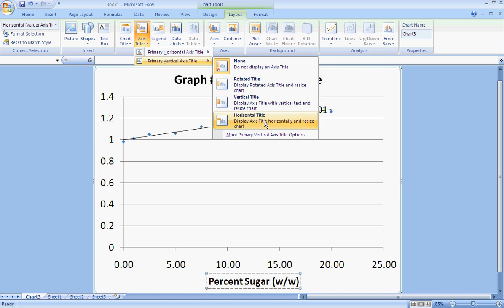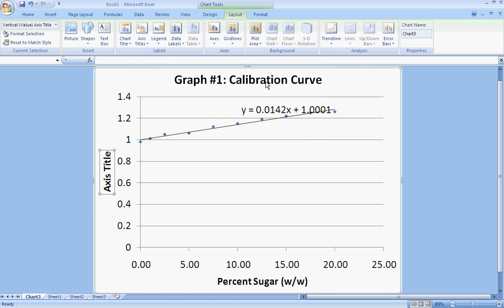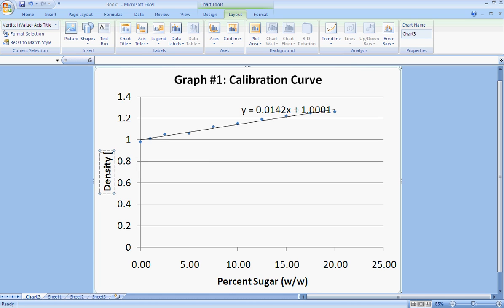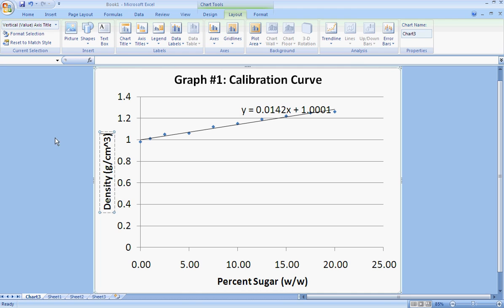And my vertical axis. You have a couple options here. I think rotated title looks nicest. And this is my density, and I want to include the units of that density, which are grams per cubic centimeter.